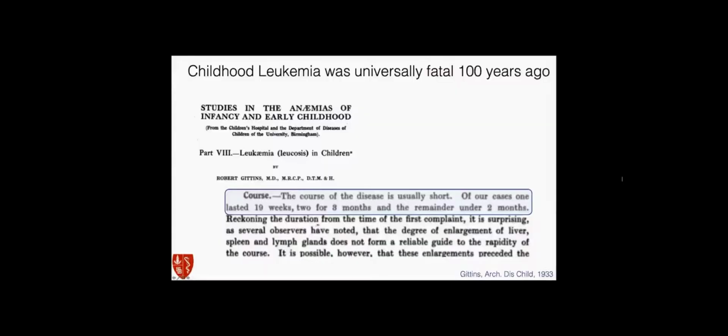Good morning, everyone. Thank you so much for the opportunity to present an ongoing project in our lab, and happy to be discussing it with you today. We're going to talk today about our work using mass cytometry to help understand CD19 negative relapse in patients who suffer these relapses following CAR T immunotherapies for acute lymphoblastic leukemia. And I want to right away give attention to the fact that this work has all been led by a fantastic postdoc in the group, Pablo Domizzi, and give him credit where credit is due.